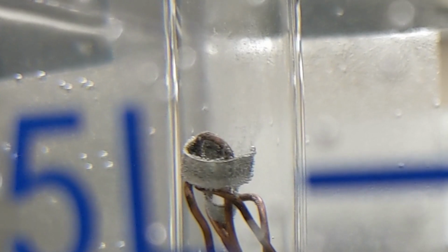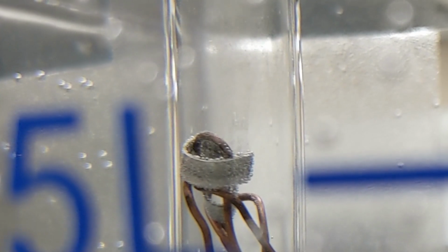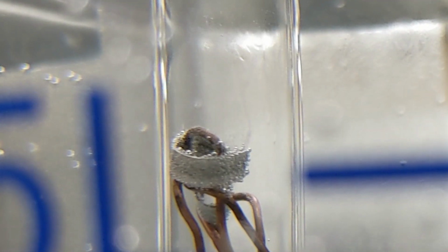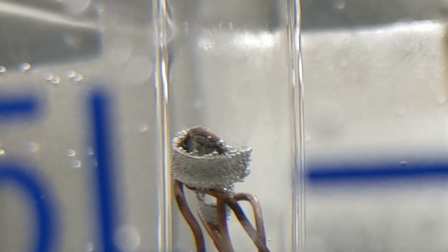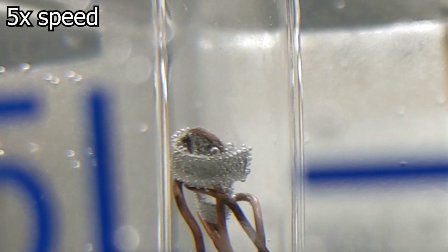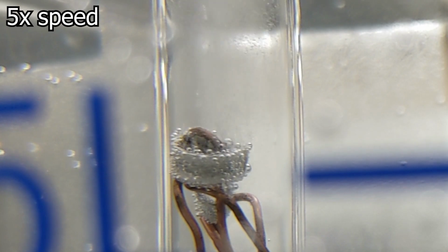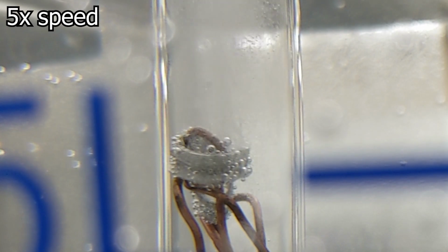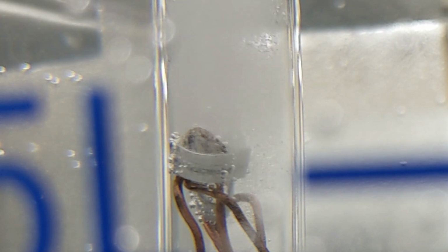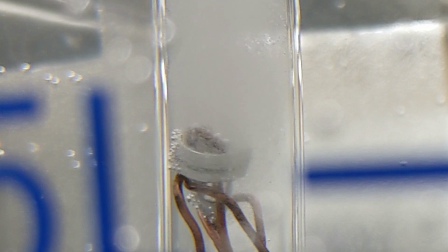And you can see the magnesium coil there. You can see the bubbles on it now. All right. Okay, so it's starting to react, and you can see the bubbles coming up. You can see the reaction is a lot faster now. We're getting a lot more bubbling.